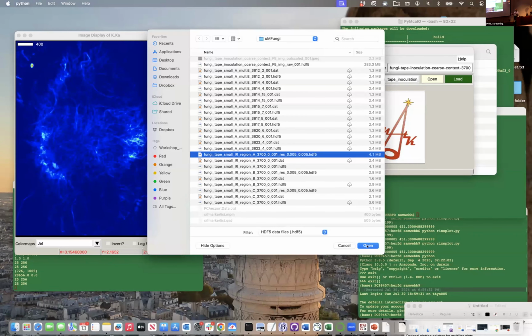Whenever you zoom in to your data set and go through the export data set, it will export the zoomed in version that you have. If you want to take another data set and put it into a larger data set, if you don't do this quick little step, you'll still keep that left high pixel and you see a big red line on the left side of your imported data. And you may not want that because it doesn't look good. So if you resize your data to the same size that it currently is on a zoom, it'll take that into account. So I've done that here.